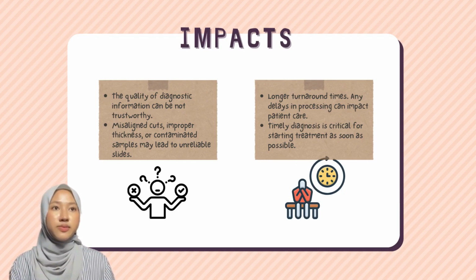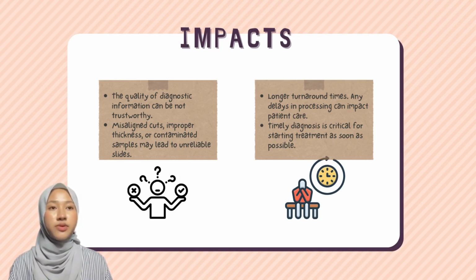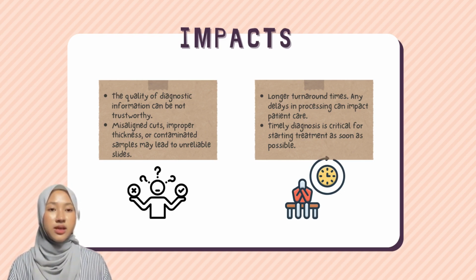Any delays in processing can impact patient care, especially in time-sensitive diagnoses like cancer. In oncology, timely diagnosis is critical for starting treatment as soon as possible. While conventional tools and methods have long been essential to histology, they do come with significant challenges that can impact diagnostic speed and accuracy. Addressing these issues is crucial to improve patient outcomes, particularly in critical diagnosis.